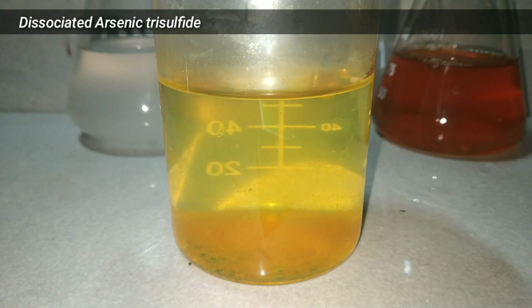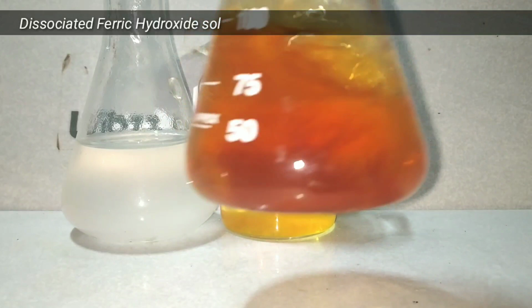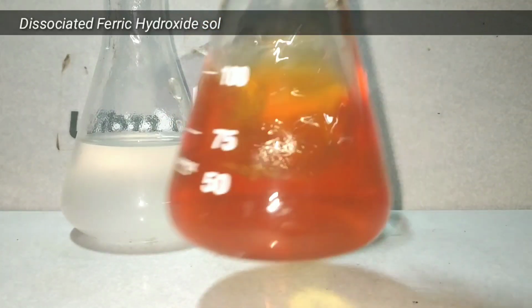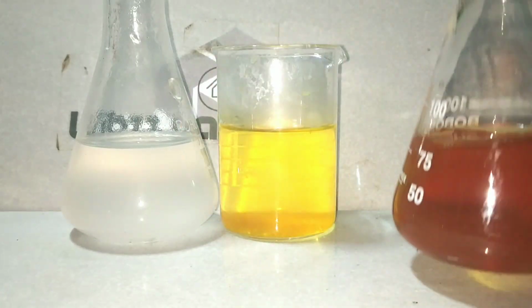Here you can see arsenic trisulfide has already precipitated within 5 to 10 minutes, and in the next clip you can see that ferric hydroxide also precipitated and the suspended particles have settled down at the bottom of the Erlenmeyer flask, which on swirling again formed the suspension.